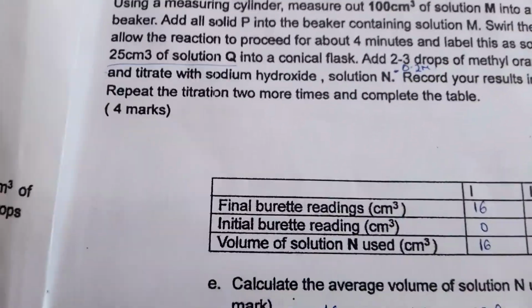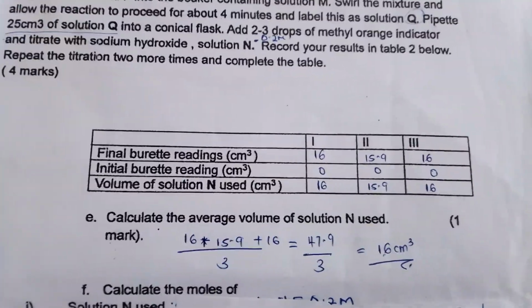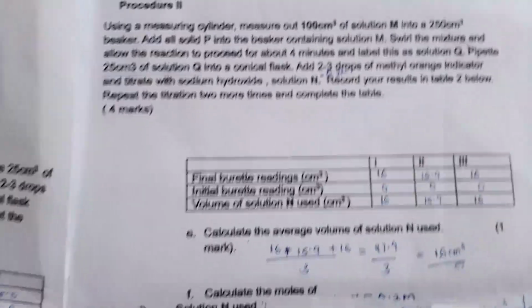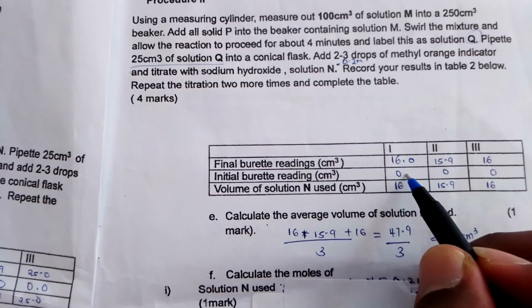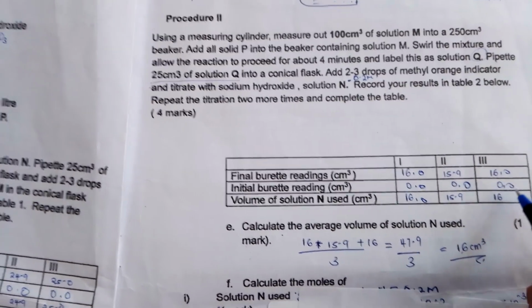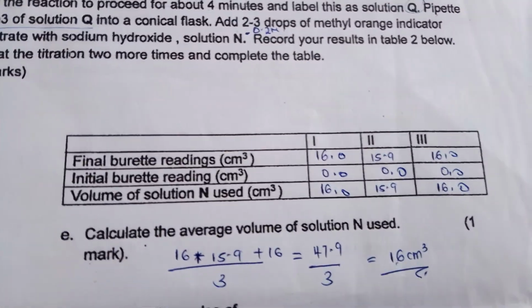After you have completed the table, it is supposed to be in the formats indicated there. So we did that titration and we found the following figures. Remember also always to follow the rules of titration, because the table is supposed to be in 1 decimal point or 2 decimal points. If you have decided on 1 decimal point, it is supposed to be maintained throughout the table, and the table must always be complete as shown below.